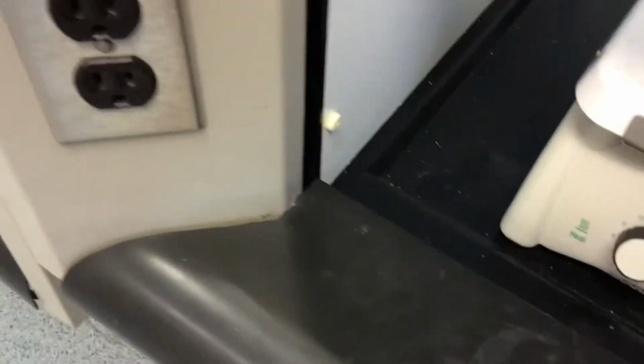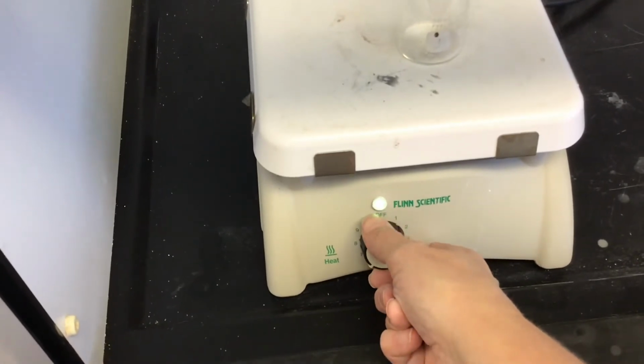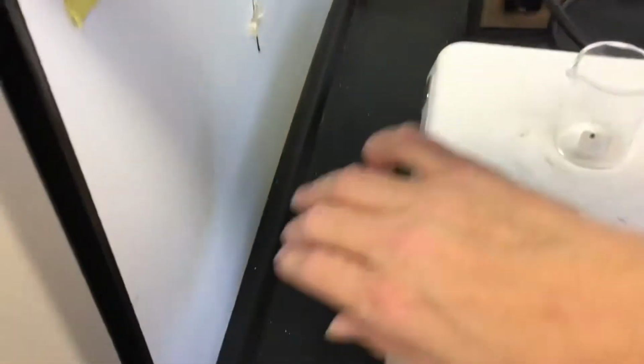Alright, so I'm going to take this beaker with my substance in it, and I'm walking with you here through the lab. I'm going to come in here, and I am in a hood. This is our hood that we have. I'm going to take this hot plate that we have right here and plug it in, because nothing works if we don't plug it in. Then I'm going to turn it on and put it on approximately 6. I'm going to show you periodically. It does take time, like 15-20 minutes.